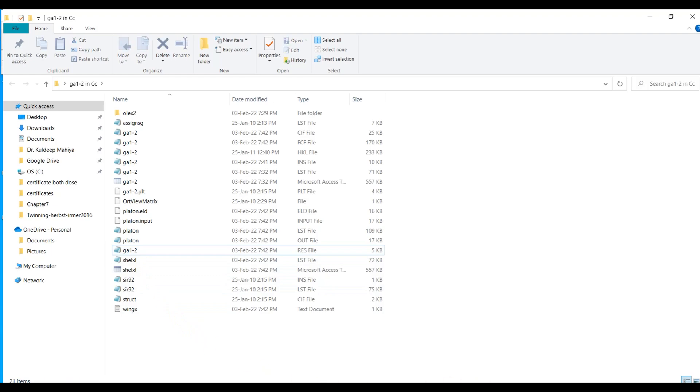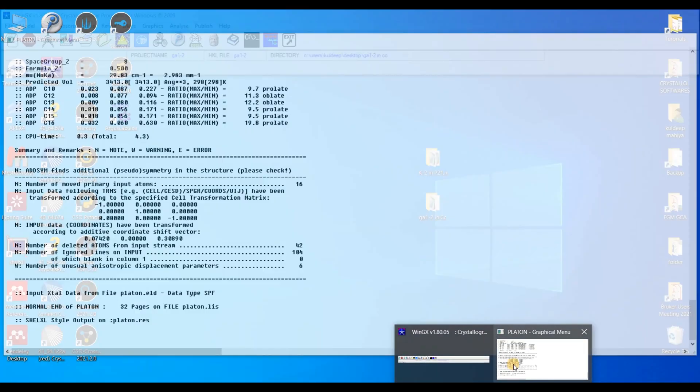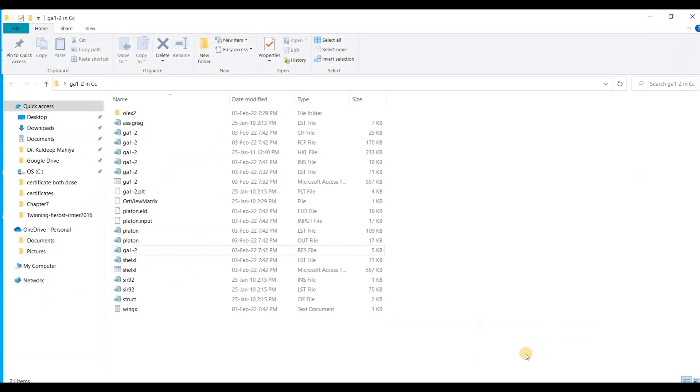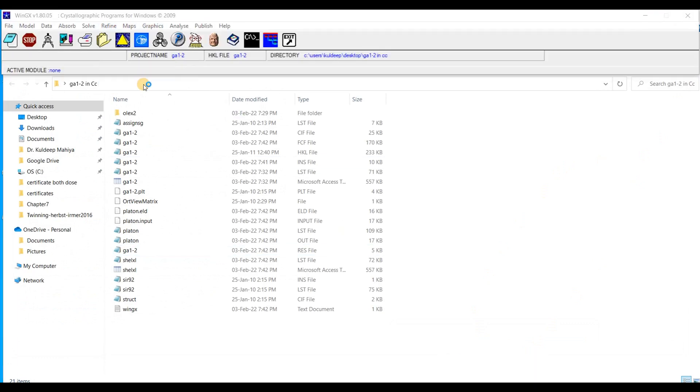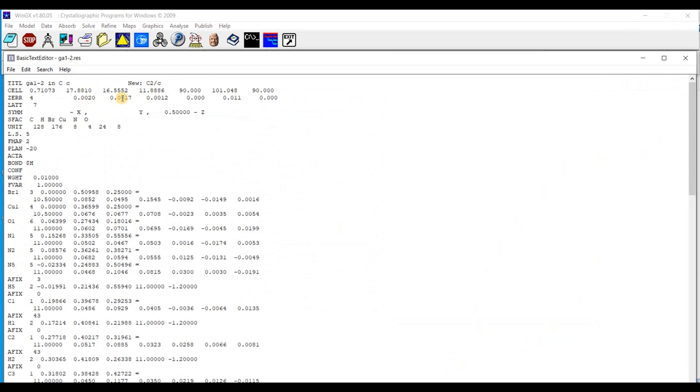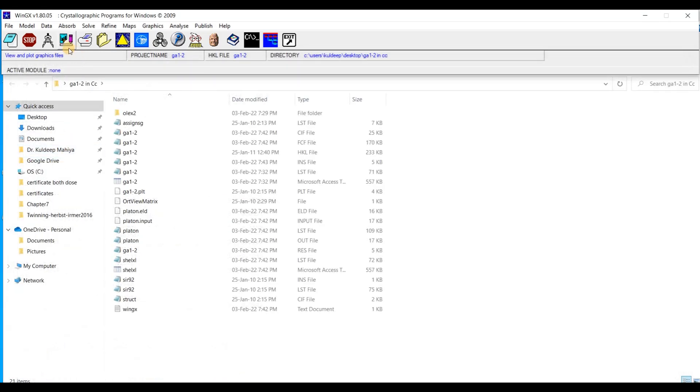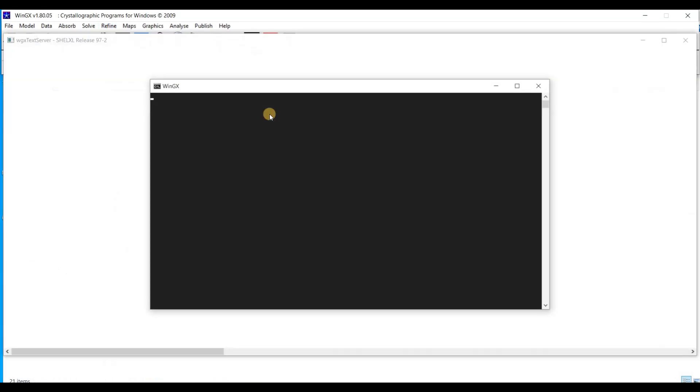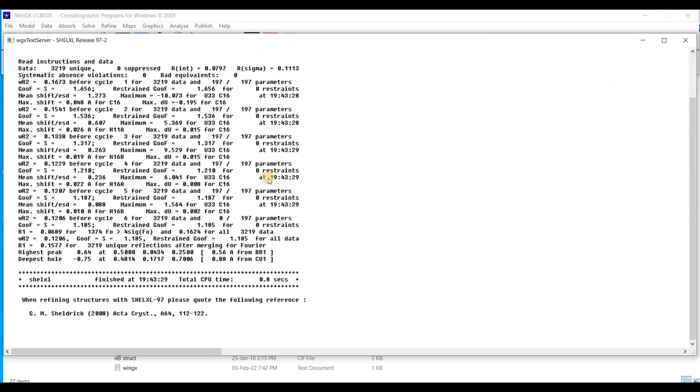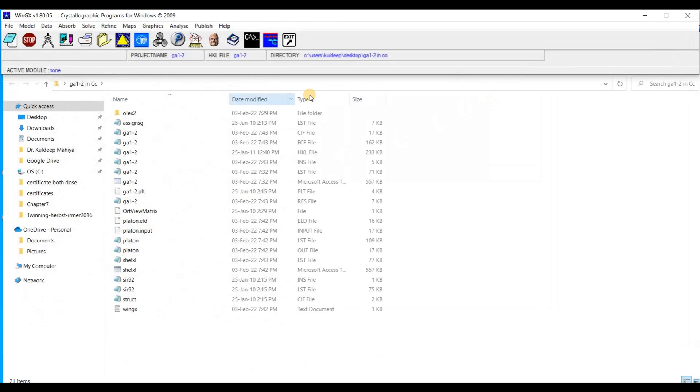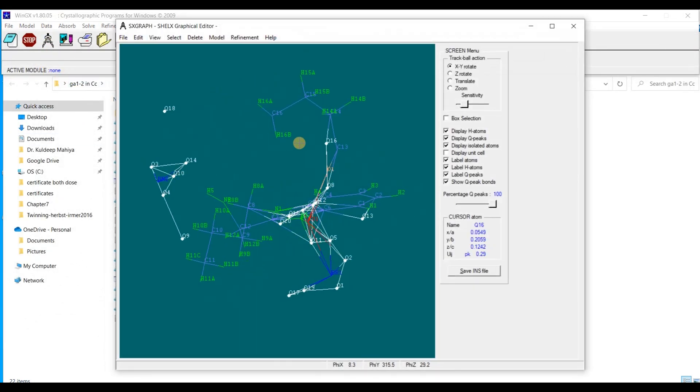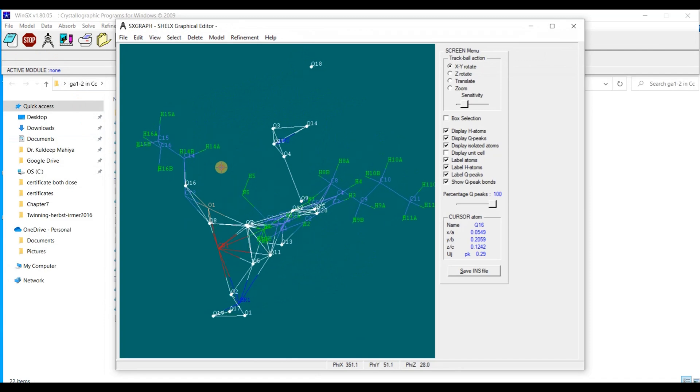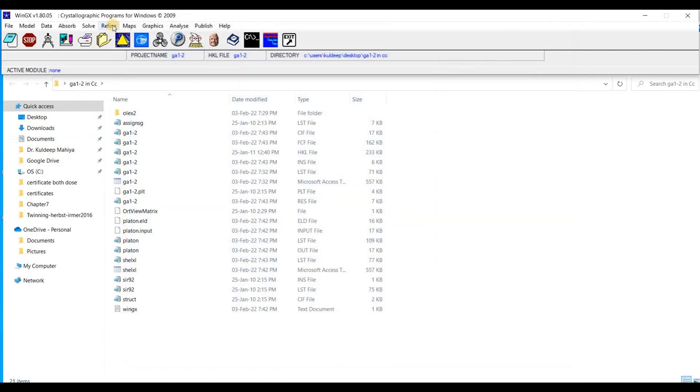Again open the WinGX. Refine, Open RES, Save as INS and exit. And refine. The R factor is around 6.89%. Now you can see the structure is changed into the space group C2/c. Refine one more time.